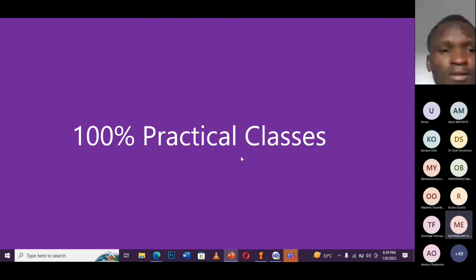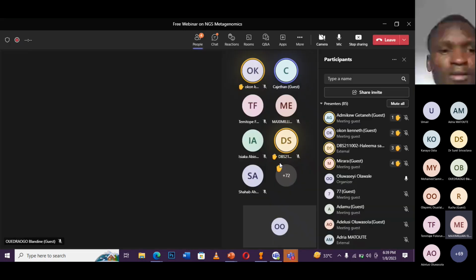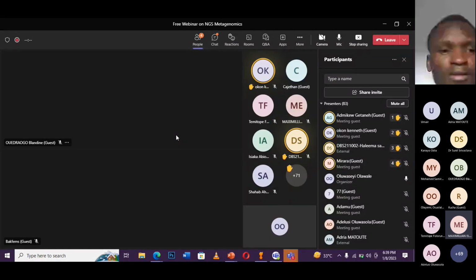In the practical courses that we're going to take you through, it's there, such that when you do analysis, you will see it classified: this particular gene is resistant to this antibiotic class, and this is the organism it is associated with in the metagenomic sample.